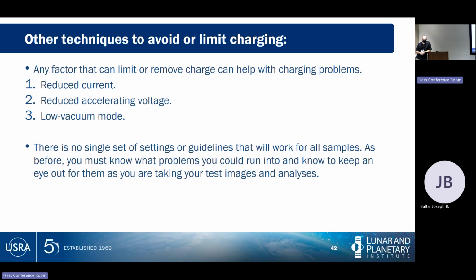In general, we started an hour ago with the statement, what are we trying to analyze? How do we get to that analysis? That is, at least to me, the way to think through this. If I'm given something that's new or interesting, I start assessing, what is it? How do I get to the analysis that I want?